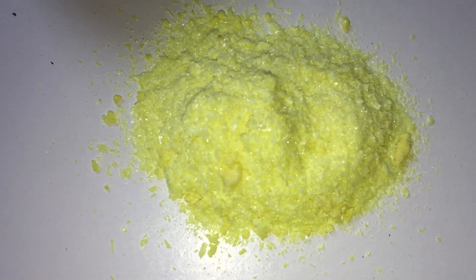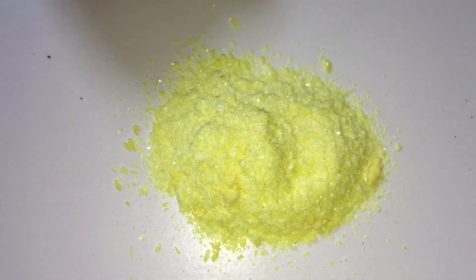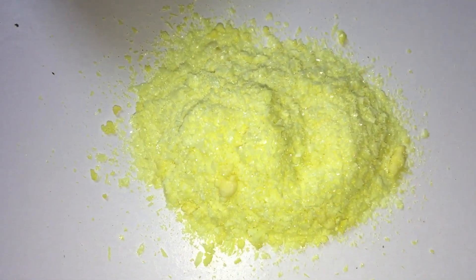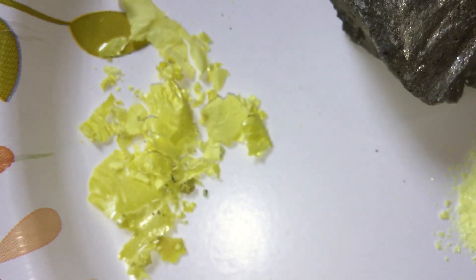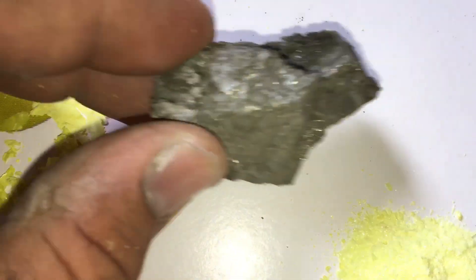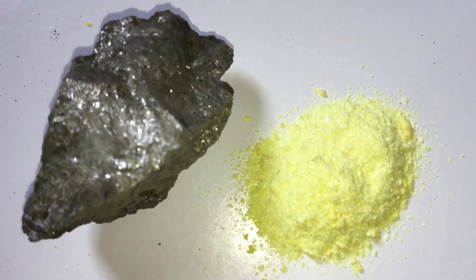Here on the right is some that I recrystallized — I just put the sulfur from the bottle into xylene, which I bought at Menards as paint thinner, heated it up on a hot plate, then let it cool and it recrystallized into these nice sulfur crystals. You can see it looks pretty pure. Over here on the left is some that was not recrystallized — just scrapings from the side of the bottle. And right here is the original iron pyrite, the rock I started with. So I went from that rock to elemental sulfur.